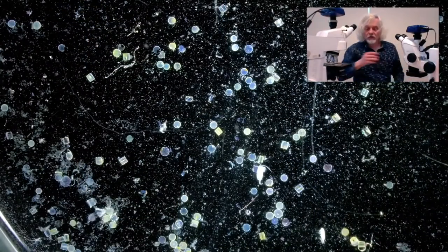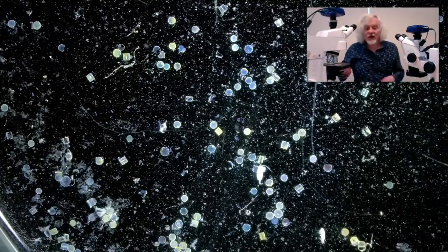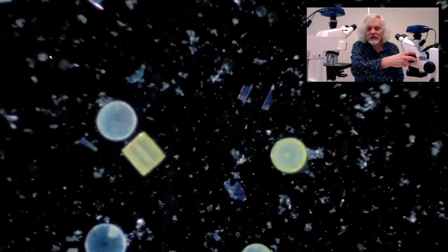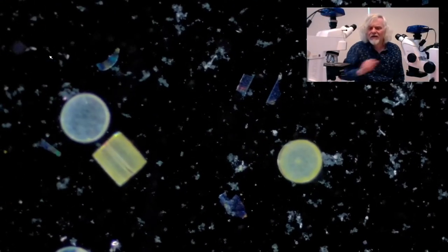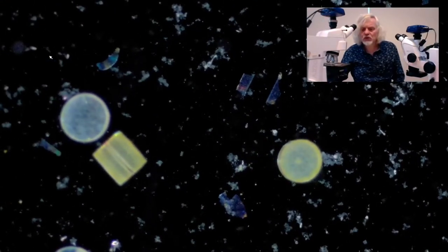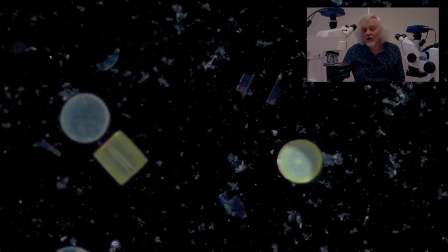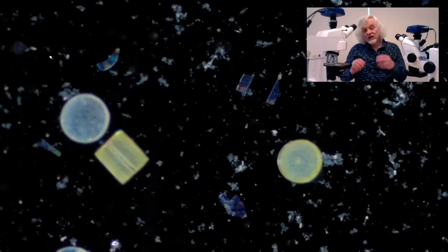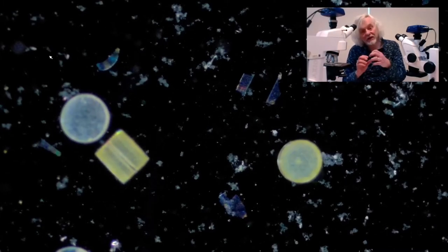Let me jump straight to my microscope. What you've got here are these tiny, I'm going to zoom right in on them, here they are, they almost look like little sweeties, don't they? They're not spherical in shape, there's one and there's one seen on its side. These things are actually shaped more like tablets.